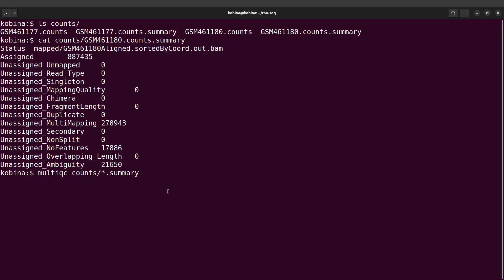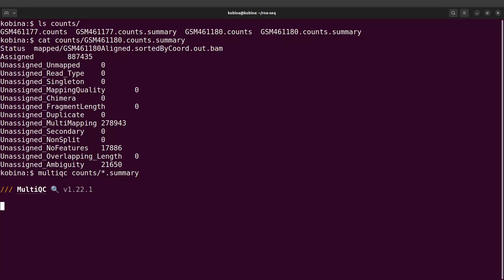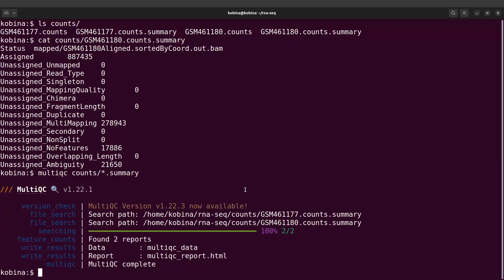So the command is: multiqc counts/*.summary. I have two of them, so I'll run this command and then MultiQC will aggregate them for me.